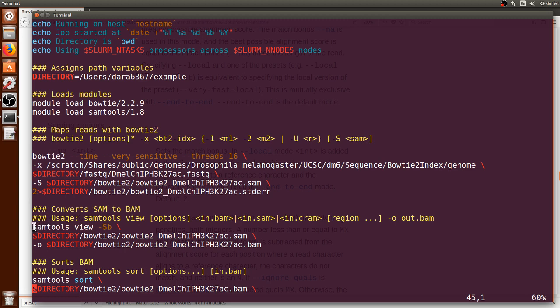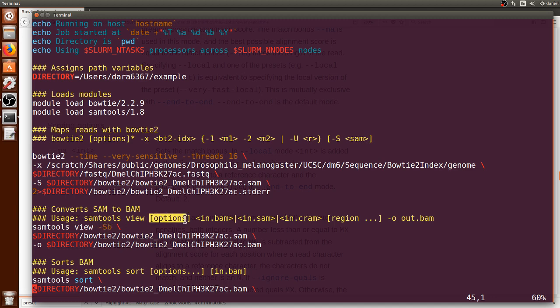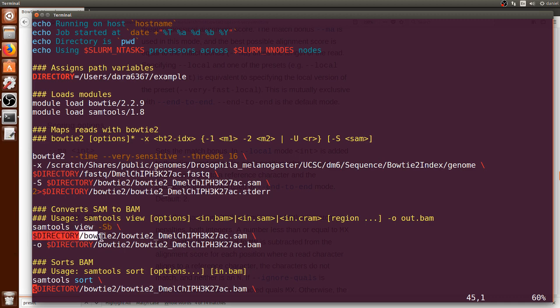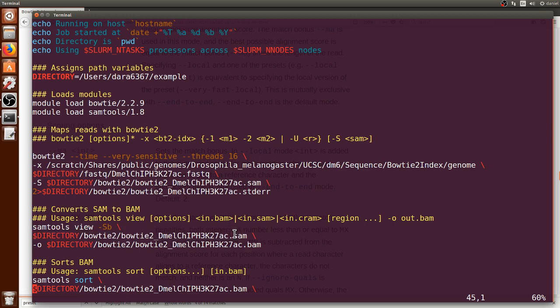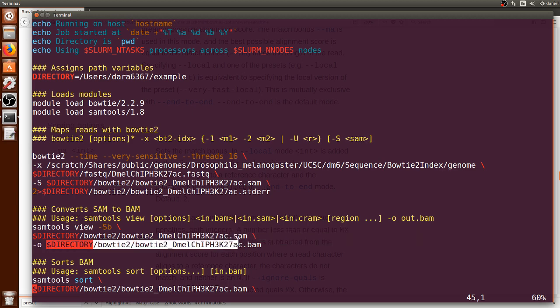In order to use this file we can use samtools and the subcommand view followed by dash capital S and lowercase b which are the options here. Capital S is just saying that the input will be a SAM file and lowercase b is that the output will be a BAM file. Afterwards you can just put the directory and the name of the input file, the SAM file, the alignment that was created by Bowtie.